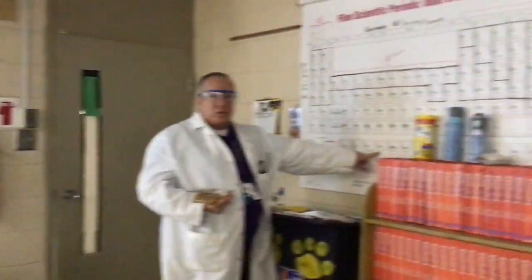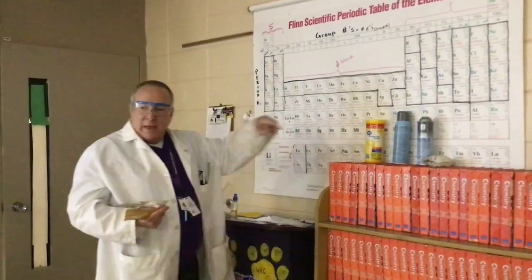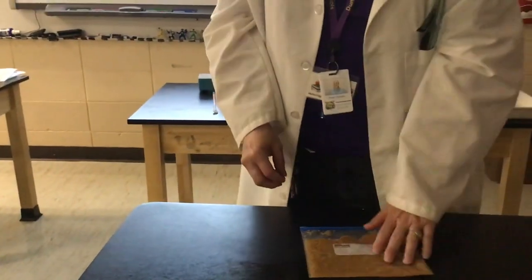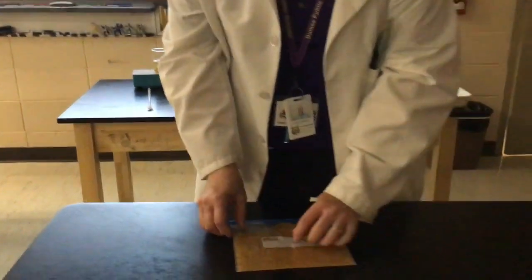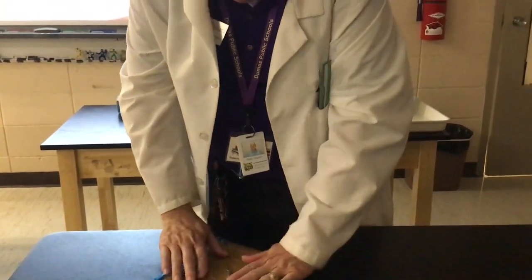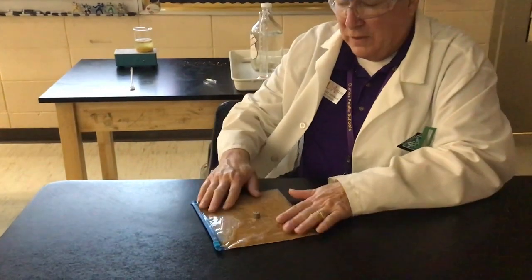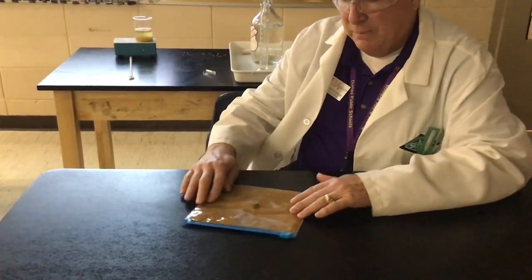It's element number 60 down here in the lanthanide series. And they are very, very powerful magnets. So I'm going to put the magnet here. Actually, let me do it on the clear side. I'm going to put the magnet here and push my slurry back and forth, trying to leave the magnet in the same place and see what we can find.